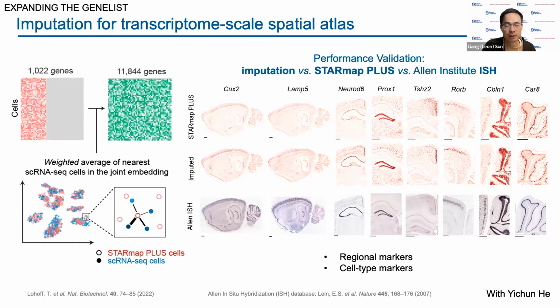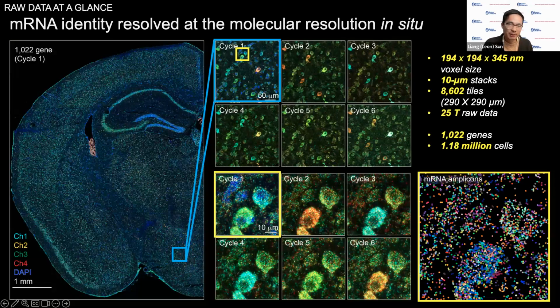Which tissue you are working on, and then how could we decide? I think you already explained that we should avoid housekeeping genes, highly expressed genes, when picking the genes for sequencing. Is there any recommended number, or is around 1,000 basically best? Or should we focus on well-known marker genes for cell types in your cell population? Could you talk a little more about that, since I'm studying a lot of tissues and wondering how I should make a decision?